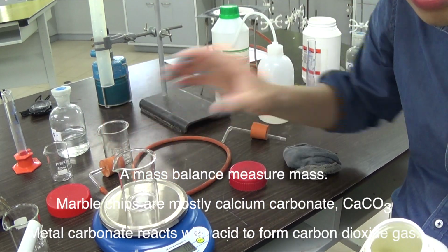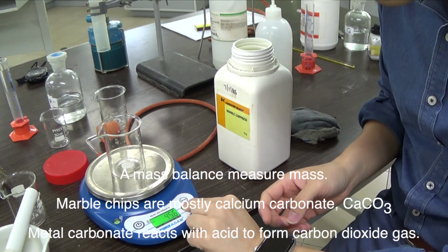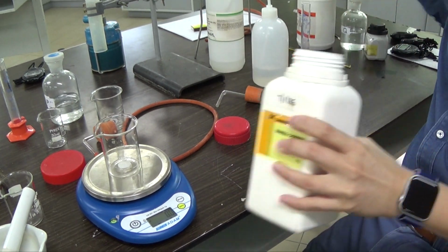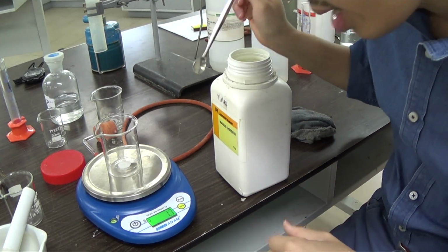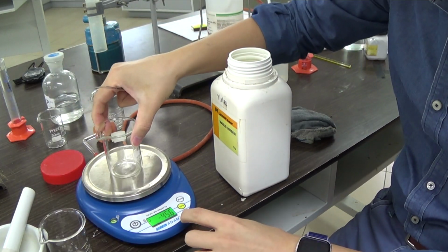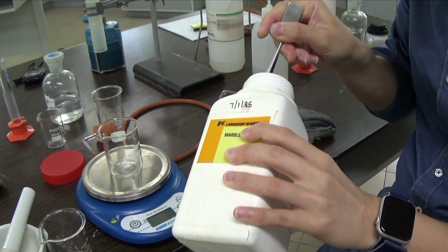I'm just going to put my beaker on top of this mass balance, and hopefully you can read that. I just press 0. That will do taring, T-A-R-E, or zero mass, it reads 0.0, taking into account the mass of the beaker. So I'm going to take out one small piece. It reads 1.7 gram of this solid here. So I would take roughly another similar size solid. They wouldn't be exactly the same mass, but they will be very, very similar mass.